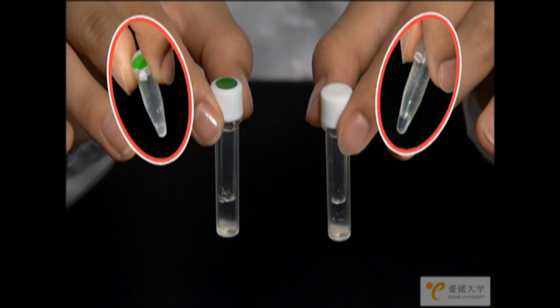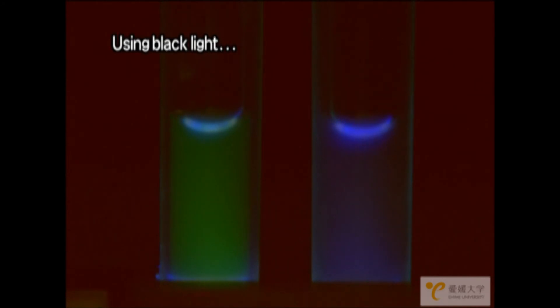Two hours after the experiment, we use a black light to confirm the presence of the fluorescent protein. You will see the solution in the green tube glow in the dark, but the contents of the unmarked tube will not. This proves that it is possible to synthesize the protein that exists in living cells.